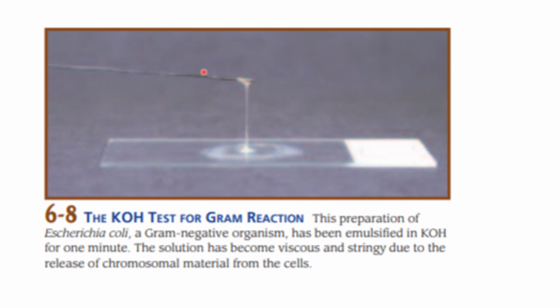Okay, and if it's gram negative, you will form this viscous, stringy adhesive structure. So it means it's gram negative. Otherwise, if it's gram positive, there's no viscous, adhesive thing here. So the emulsion remains watery.